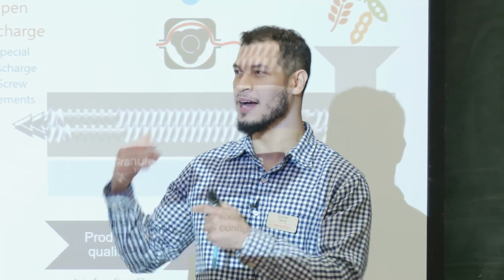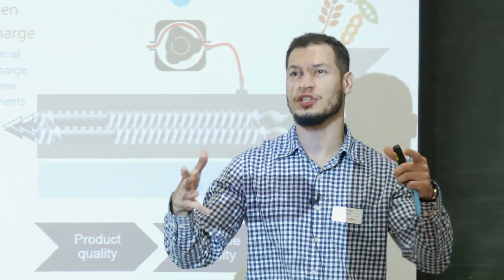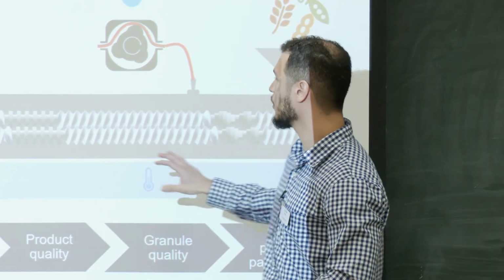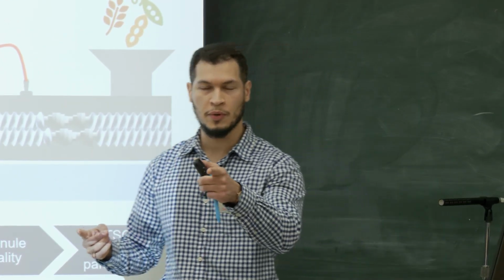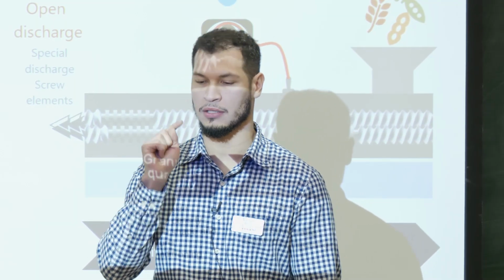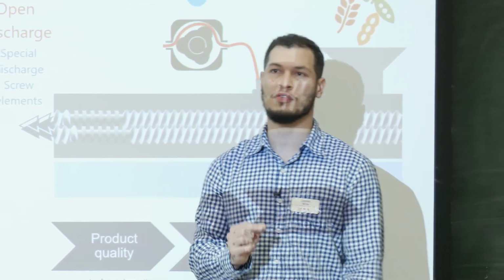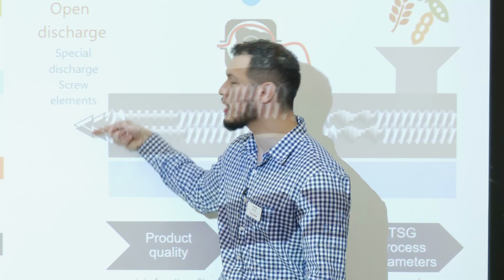Actually, that's a good point. Yesterday, Professor Ulrika, I'm referring to your talk a lot because it's just to complement. We have preconditioning for big extruders, to do the preconditioning and then add this material into the extruder. But here with the Process 11, you can use the same instrument for both processes. You remember when we turn on the extruder, we have the options between HME, hot melt extrusion, and TSG, twin screw granulation. So you basically select what kind of process you want to do. The screw profile is a little bit longer because it sticks out of the extruder and it's going to break the granules. I'm going to show a video in the next slide, this one.